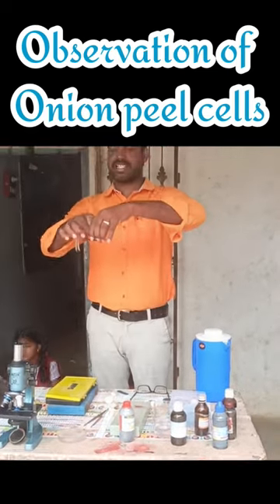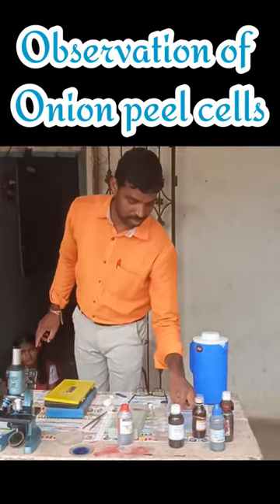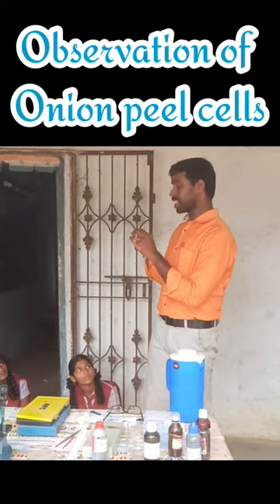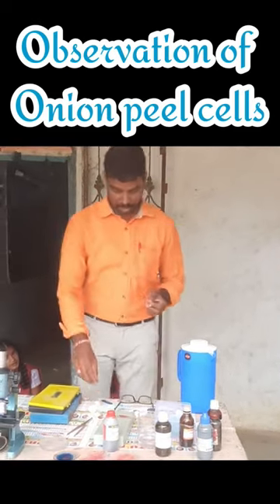Add one or two drops of methylene blue or safranin. Then take the onion peel and keep it on a slide.